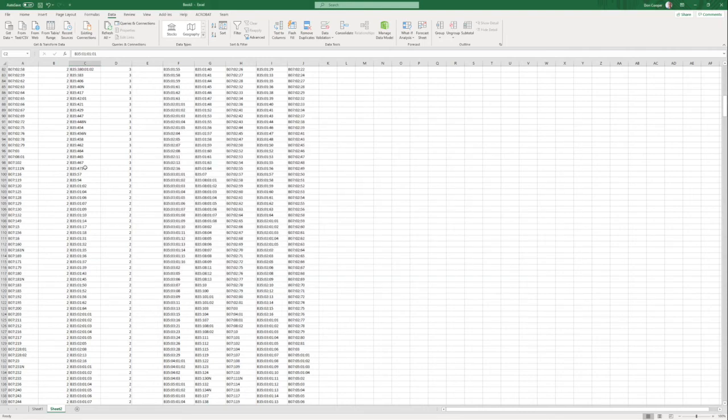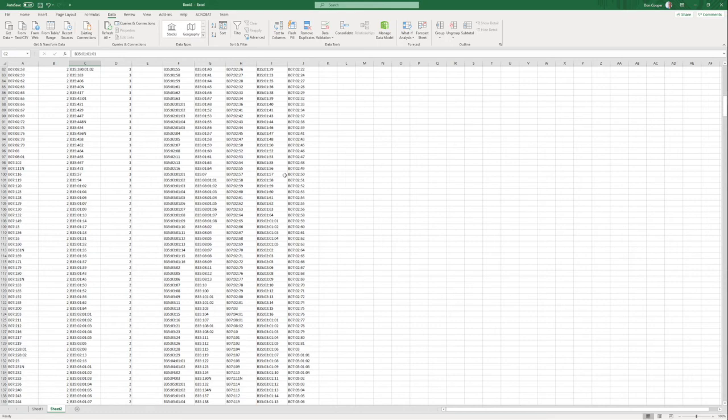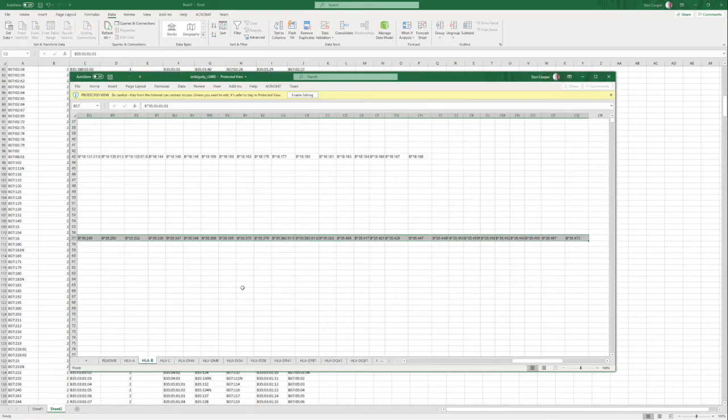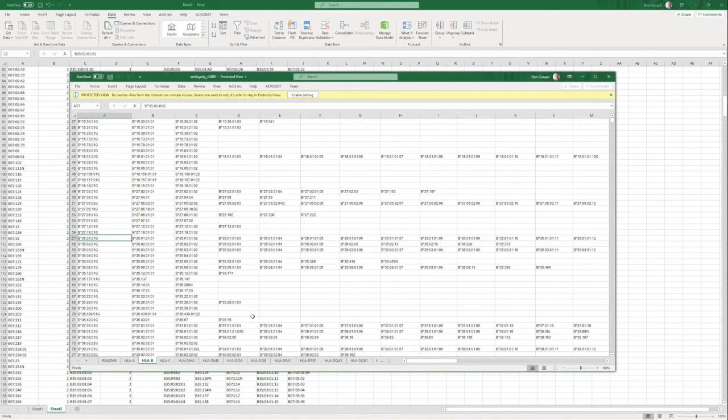So based on that, we can now call our allele as being B 0, 7, 10 from the A consensus, plus B 35, 0, 1, 0, 1, G. And that's the call.